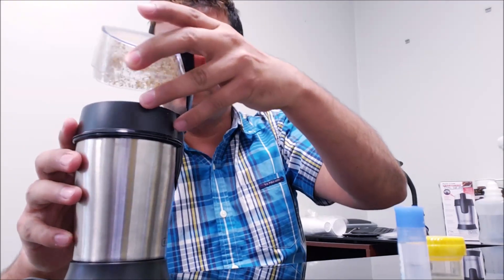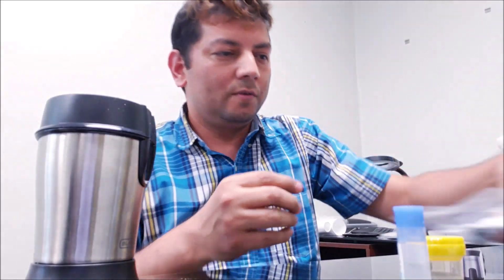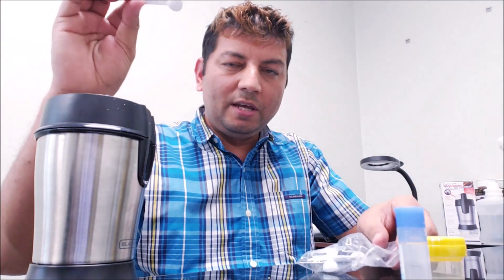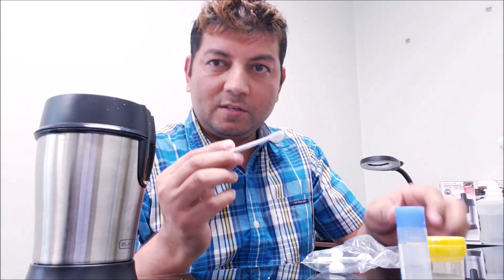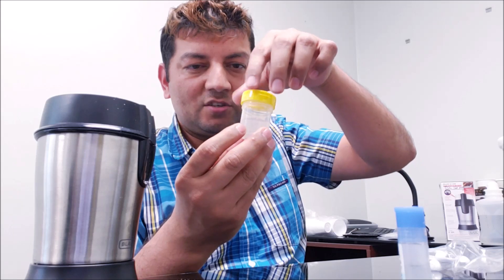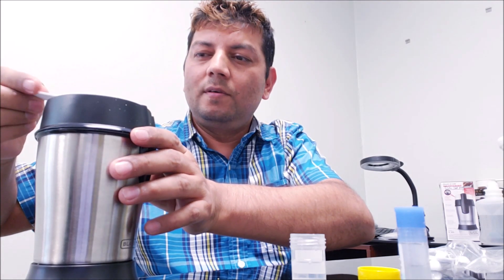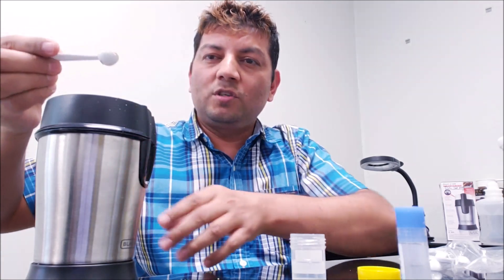This is powder now. I'm going to take a one gram sample — I can use a spoon here. My test kit manufacturer provided me this small spoon. Here is the extraction solution. I'm adding one full spoon of powder, which is approximately one gram.